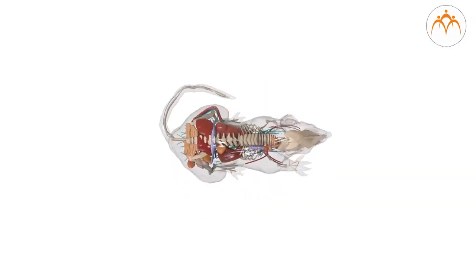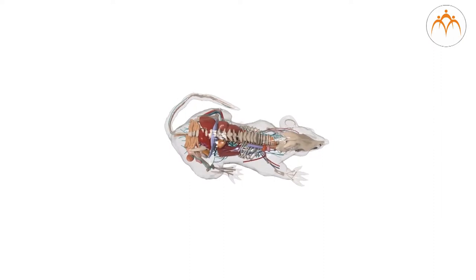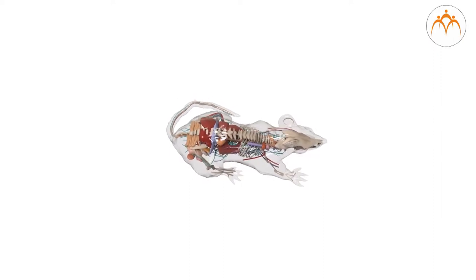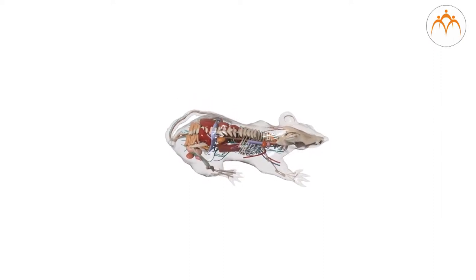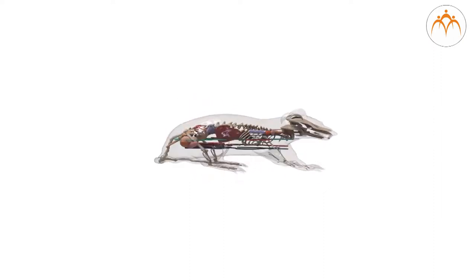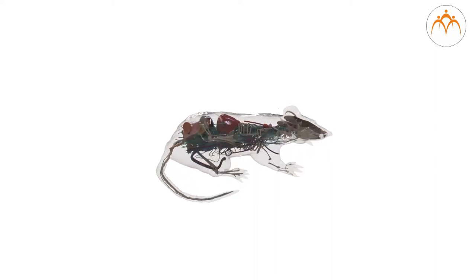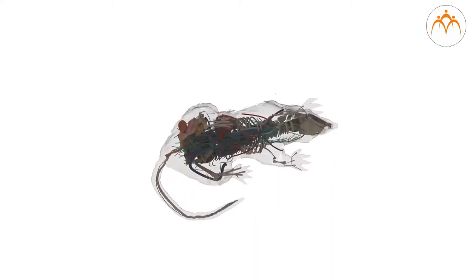When rat is dissected, it is cut open from the lower or ventral side. On this side, various organ systems are present. The digestive system is seen first when rat is dissected. Now let's study the different organs of the digestive system.